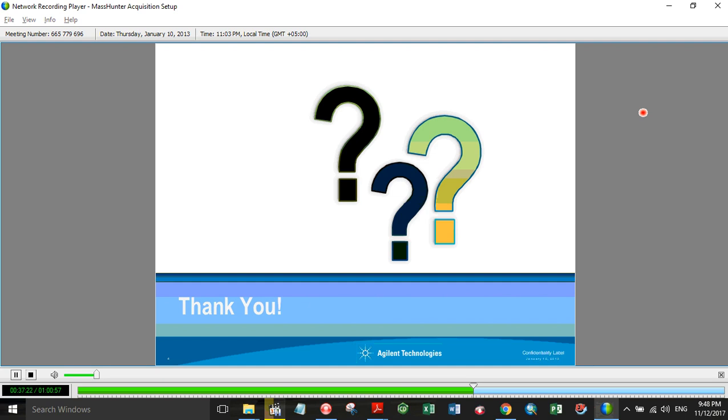Thank you. Our next one, do you have an idea on when the MassHunter acquisition on a 5975 will be possible? From what I've been told, early March, you will have acquisition for a 5975 in MassHunter.